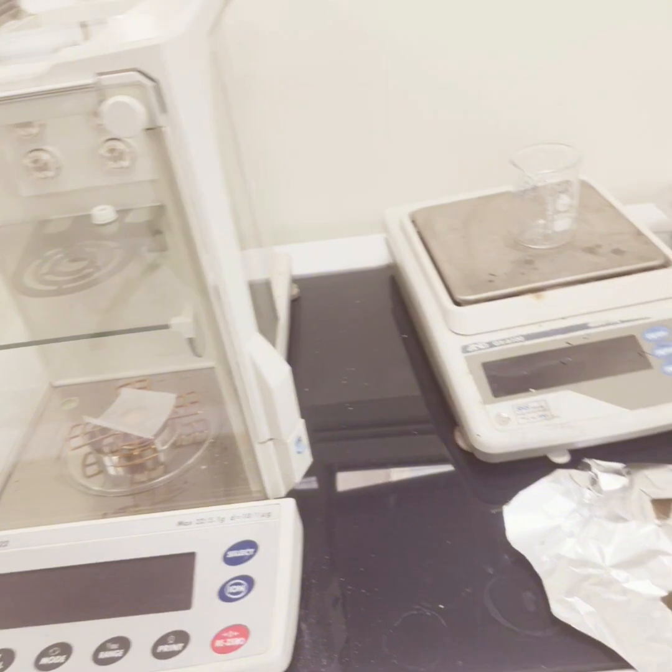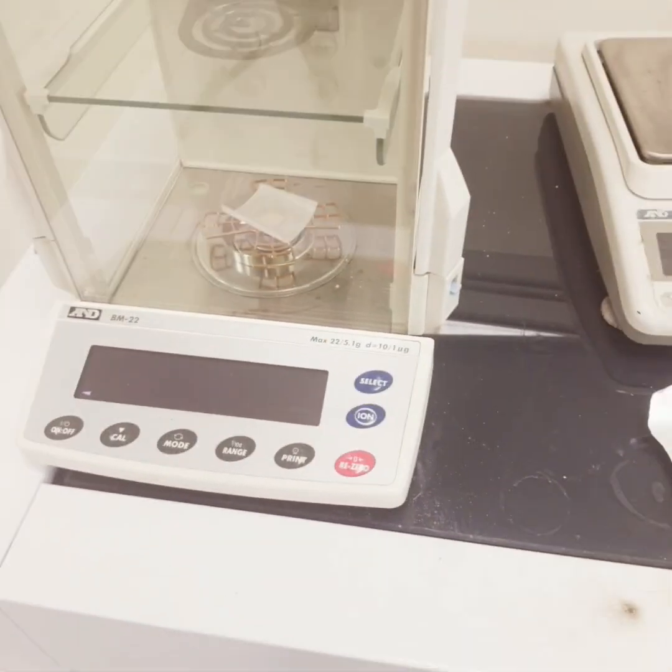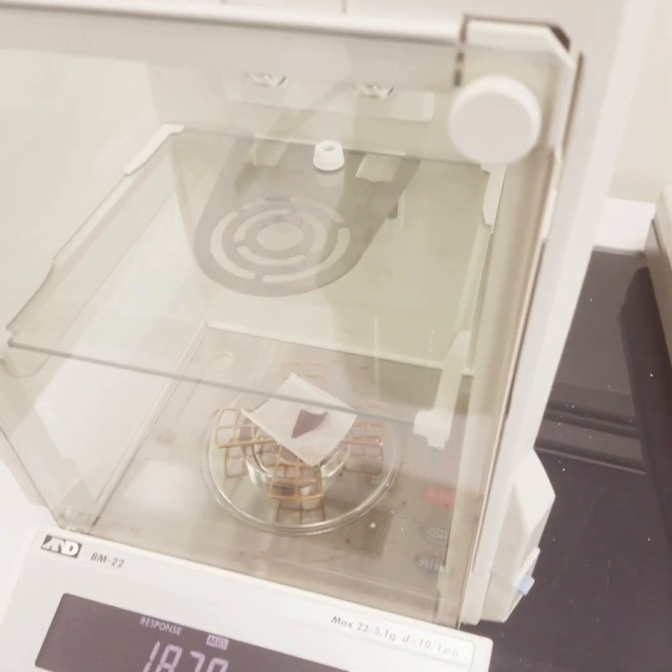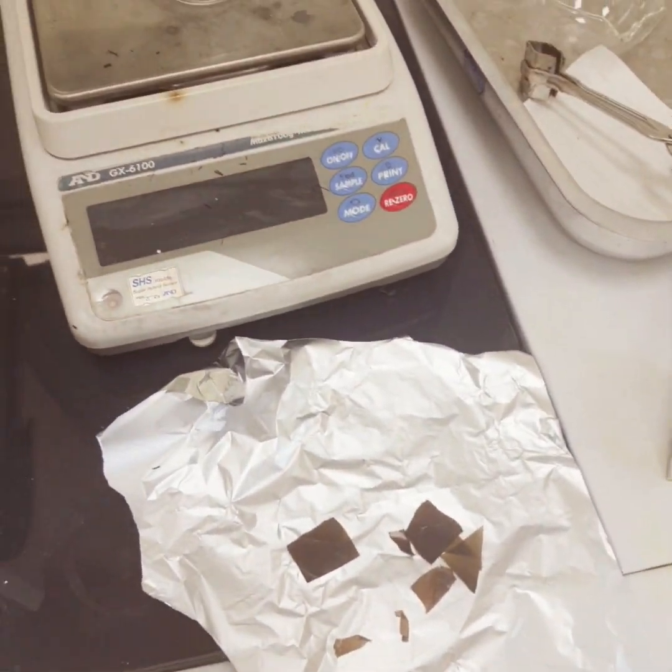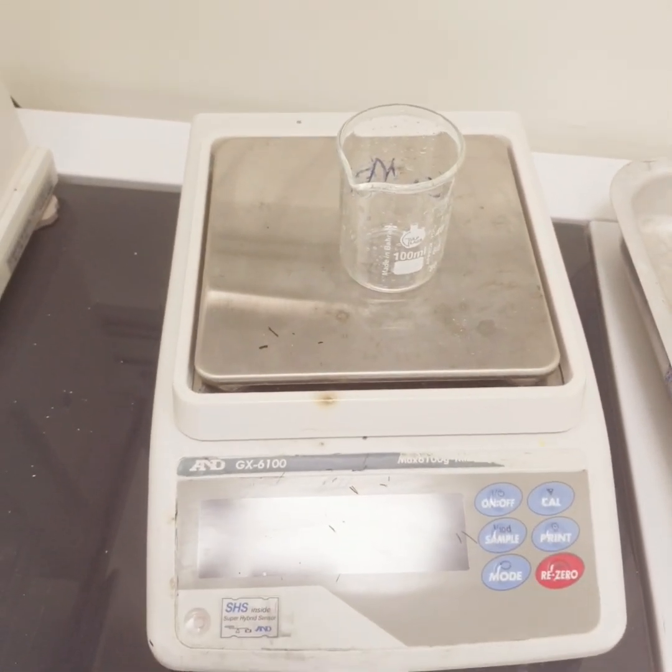First of all we will weigh this membrane. This is around 18 milligram of the membrane. Now we will transfer this portion. Before transferring the methylene blue solution to the jar or flask, we will first of all measure its concentration.